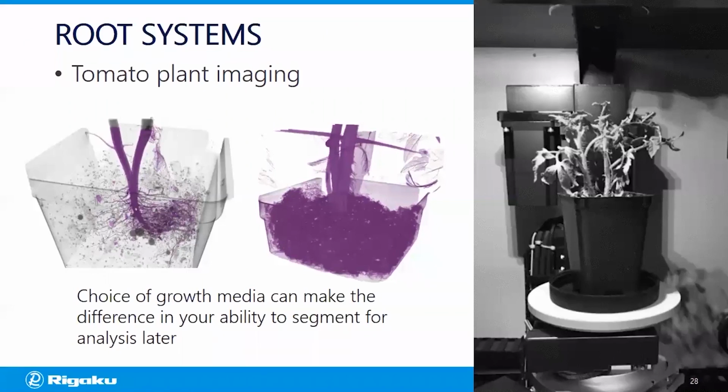So these 3D images from the CT experiments show that it's much easier to isolate the root system in the peat mix sample compared to the coir mix. In fact, it's possible to use simple window leveling to isolate the root on the left side here, where window leveling does not isolate the root from the coir sample on the right.